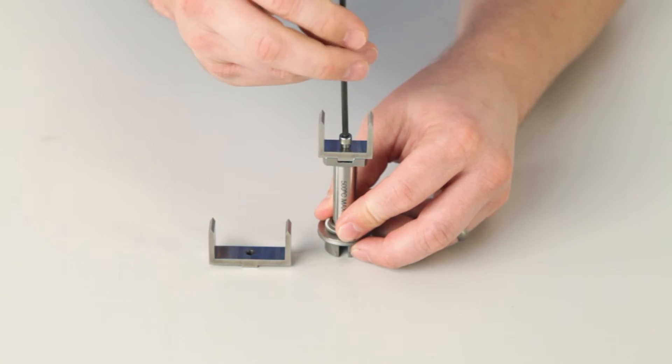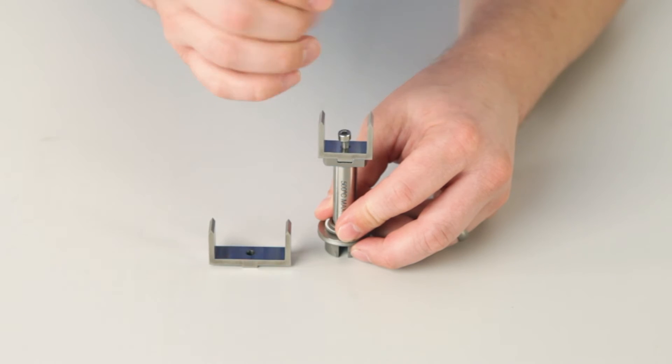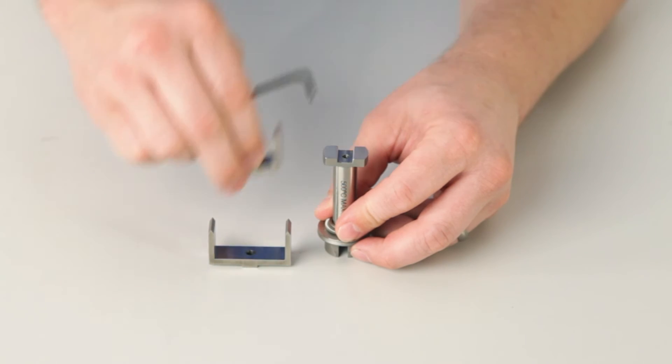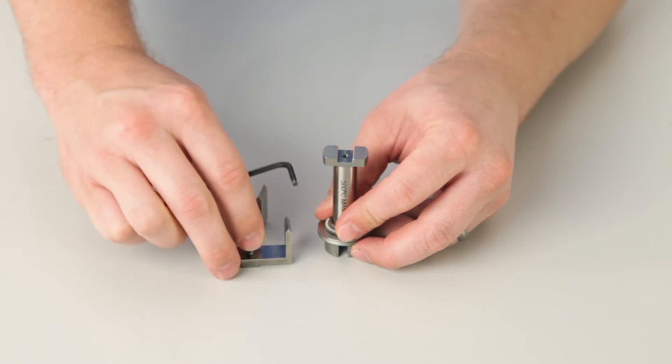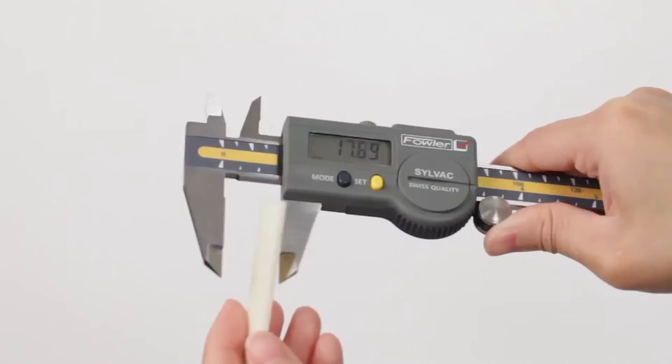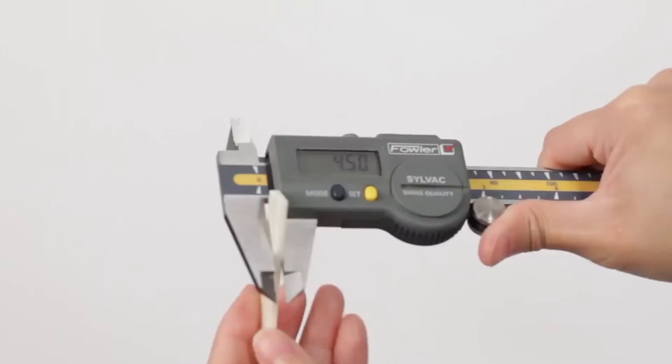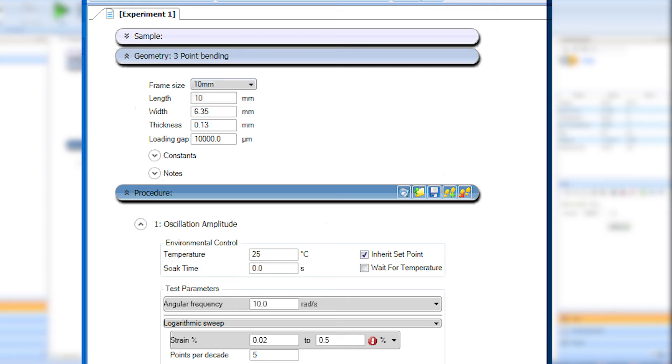Using the appropriate hex key, remove the 25 millimeter frame and install a different size frame if desired. Use the calipers to measure your sample. Choose the correct frame size from the drop-down menu, then enter the width and thickness under the geometry file.